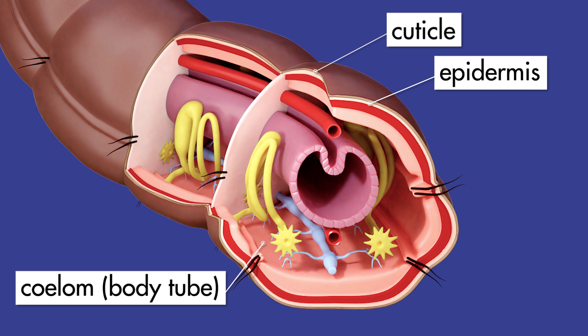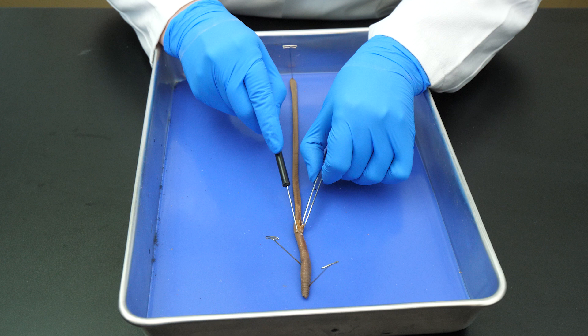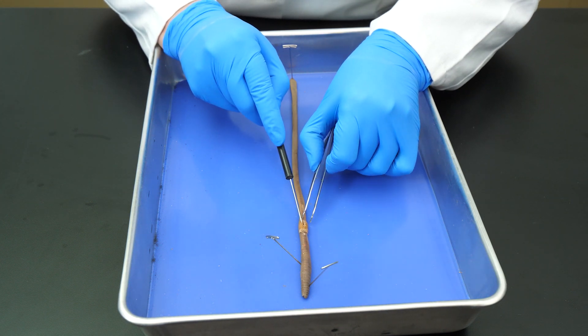Between each segment of the earthworm is a transverse wall of tissue called a septum. The septa also hold the organs in place. We need to cut the septa from the skin so we can open up the worm to see its internal organs.